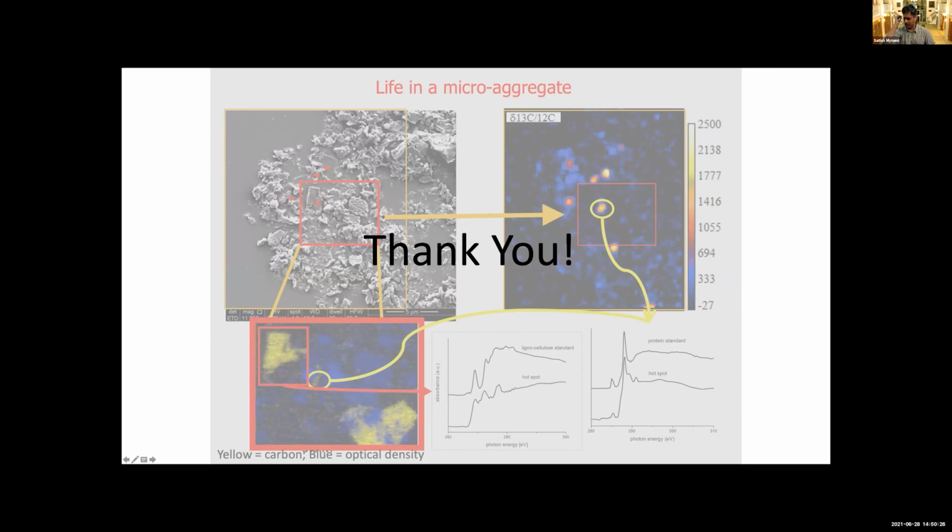Well, I have a question. So using STXM, I know you can identify different pools of carbon, and I'm wondering whether we can improve the detection method somehow with a combination of techniques.